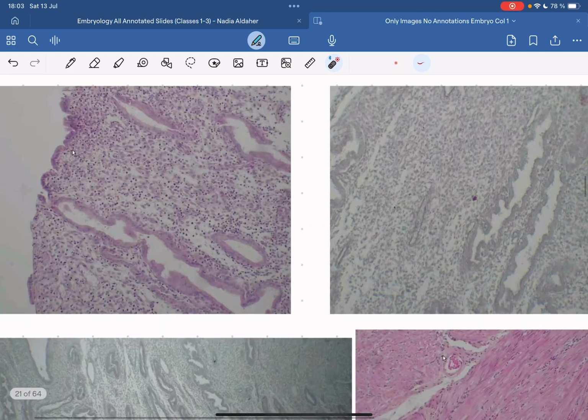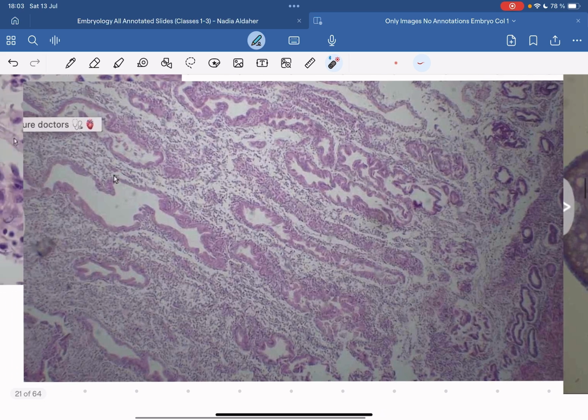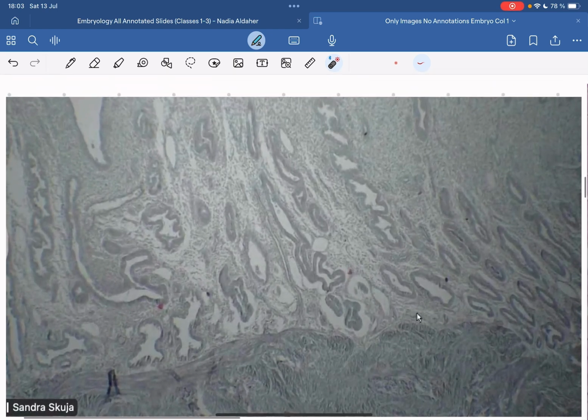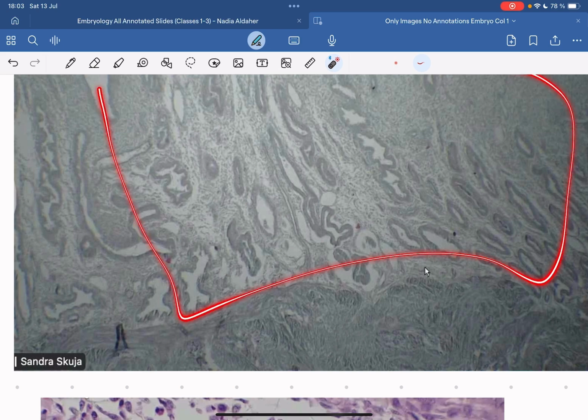I might not even add it in for the test yourself videos, just because again this is not my strong suit when it comes to the human uterus. Also, another thing to point out is that because the microscope is this zoomed into the slide, again, take this with a grain of salt, but I doubt they'll ask you about the layers of the human uterus besides the 2 layers in the endometrium, stratum functionale and basale.